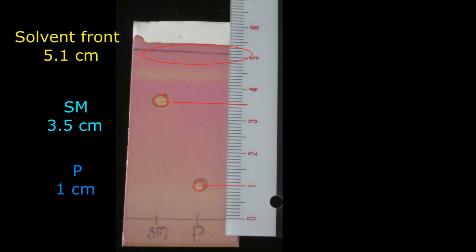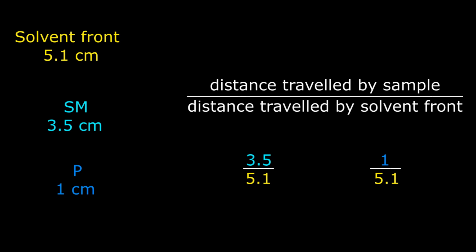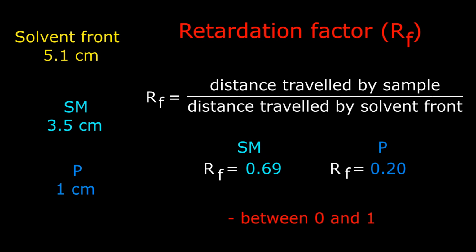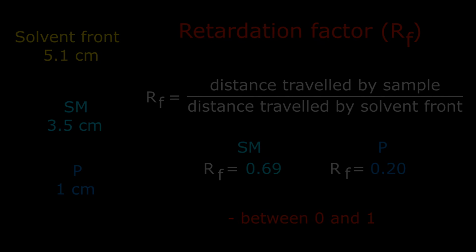Using the spots on the visualized plate, measure and record the distance traveled by each sample from the origin line. Repeat this measurement for the distance from the origin line to the solvent front. Divide the distance traveled for each spot by the solvent front. This gives a ratio called the retardation factor, or RF. RF values should be between 0 and 1. RF values can be used to identify an unknown sample with a known compound on the same plate.